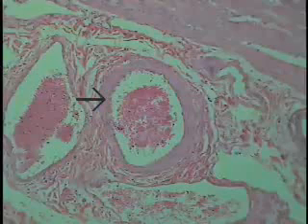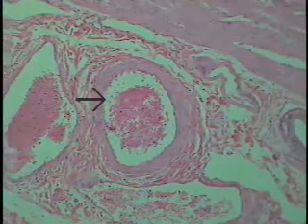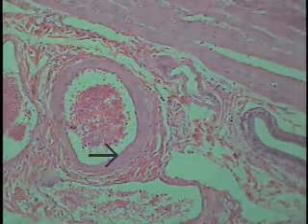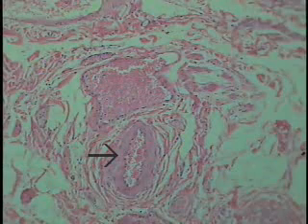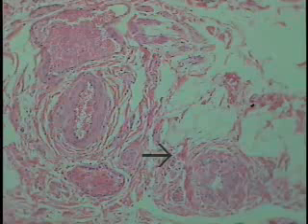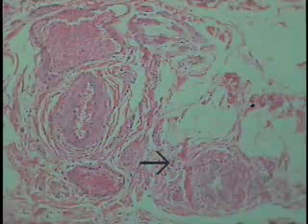So these all will show the predominance of the tunica media, characterized by smooth muscle, and all will show that retained internal elastic laminae. So these are all different calibers of small arteries, all characterized, or the feature that is most prominent is the tunica media and its smooth muscle wall. Although the other layers, the tunica intima with the internal elastic membrane and endothelium, the tunica adventitia, are also present, as you can see, they are becoming smaller, which would make sense until you finally get to this level and approaching the end of the arterial side of the vascular tree.